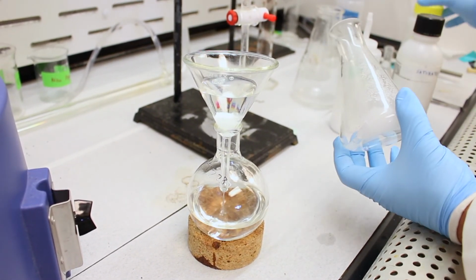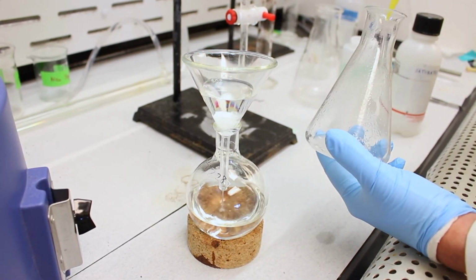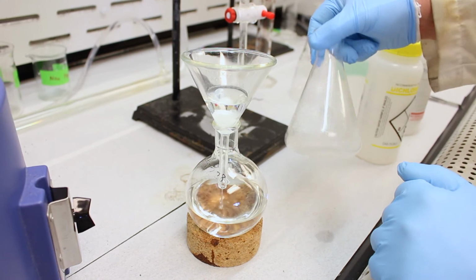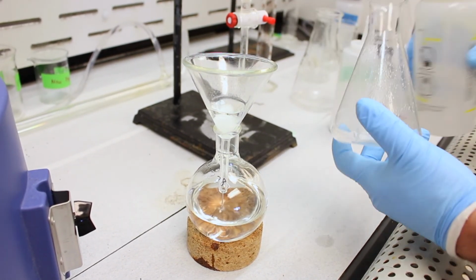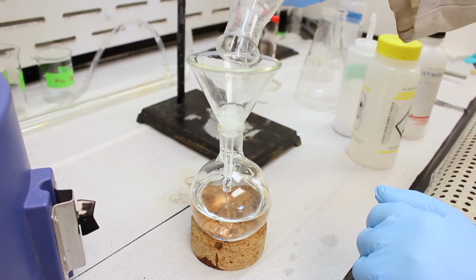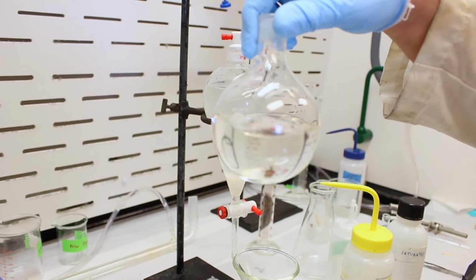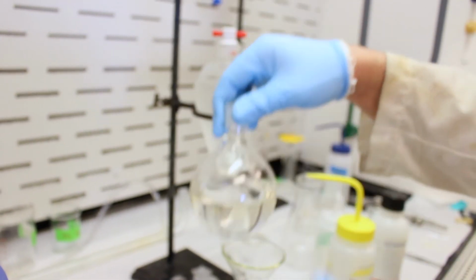Okay, now it's always good practice to rinse out the previous vessel to make sure you get all of it. So there's still a little bit of eugenol and DCM in here, so we'll rinse it out with a little DCM too. So I'll shake this around. Okay, now I'll do a few more times. Okay, so now we have our crystal clear solution. There's no sodium sulfate in it, and there's no water, so it just has DCM and eugenol. So now we just have to remove the dichloromethane on the rotovap.